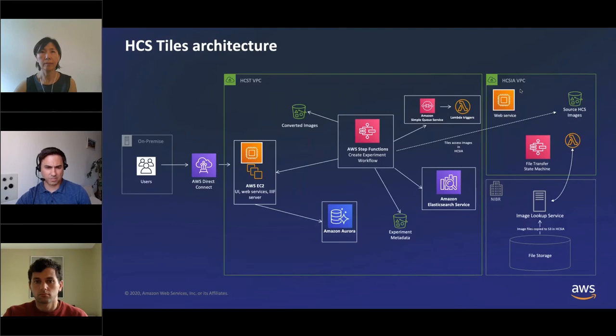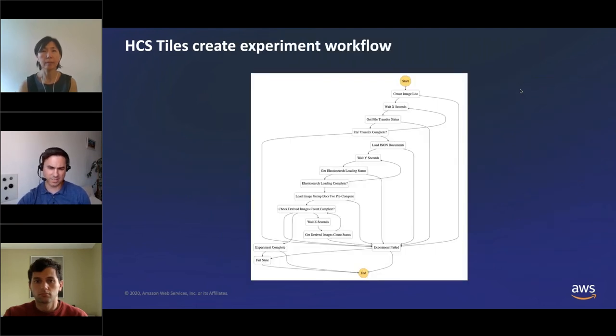Okay, so we talked about the high-level architecture, sort of from an airplane. Let's dive into the state machine. So here you'll see the main HCS tile state machine. We're calling this the create experiment state machine. So what does it do?